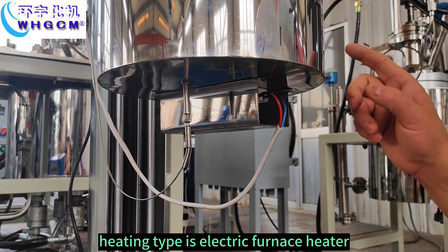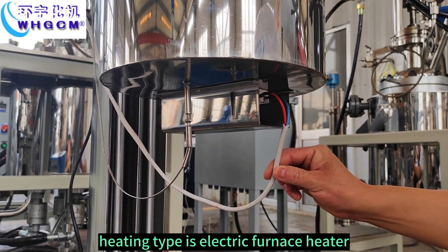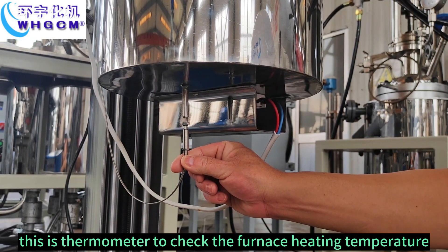Heating type is electric furnace heater. This is a thermometer to check the furnace heating temperature.